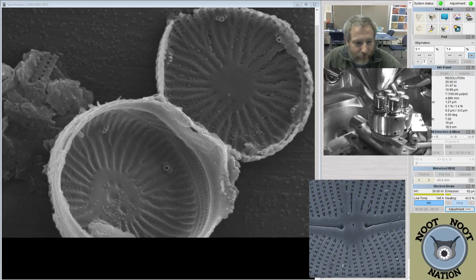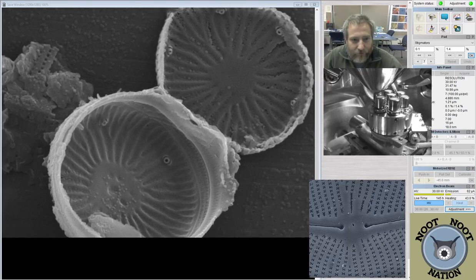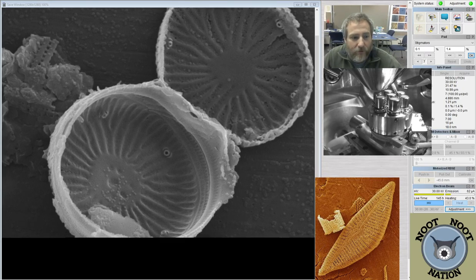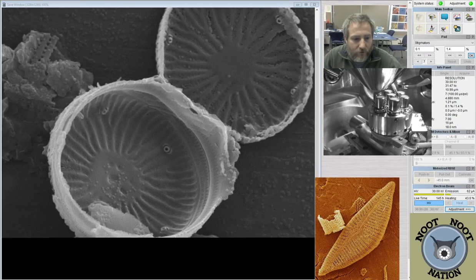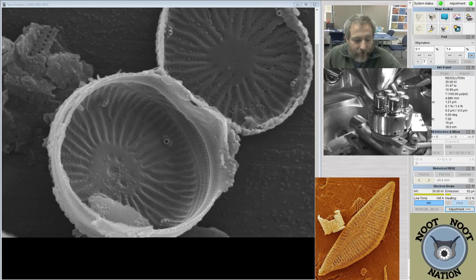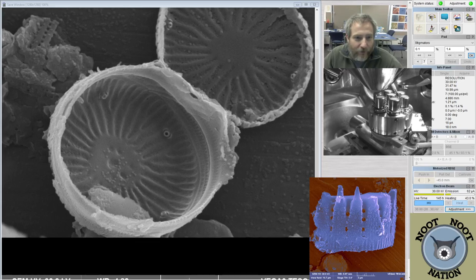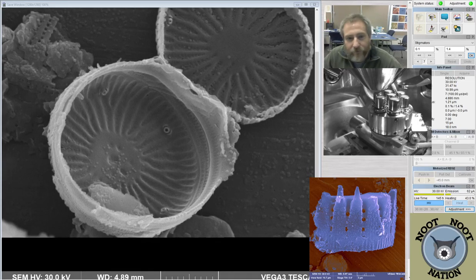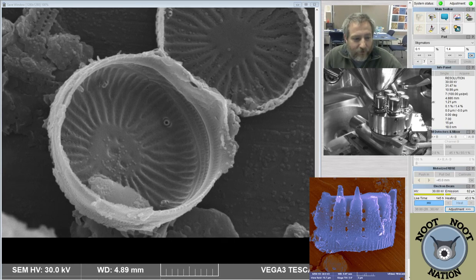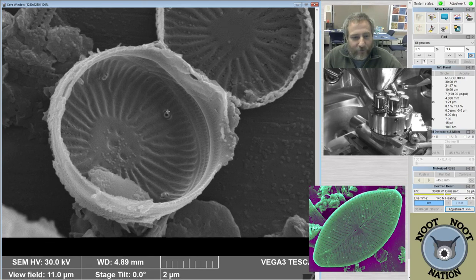So, hey, Pacific Plankton. Welcome back. How's your class running? Was it fun? Did you see anything good in your plankton samples? That's good. We're looking at a tiny Discostella. It's cracked open. We can see inside of both valves. You saw diatoms? Well, that doesn't surprise me. Pretty common occurrence in your samples, I think.